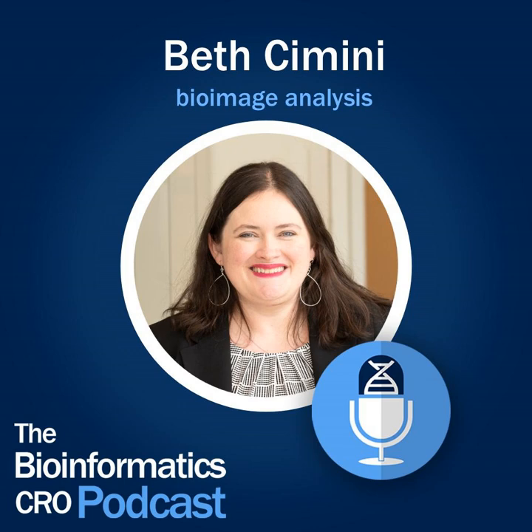Which bottleneck, if solved, would change bioimage analysis the fastest? Oh, that's a good question. It's going to be a very unexciting answer, but metadata standardization. I mentioned there's a million different things that could be in an image, and a cell could be 1 pixel, it could be the whole field of view. We have no common way to describe what's in an image, which means we have no common way to even say, should these two images look the same, yes or no? And that goes to the thing about quality standards being hard.